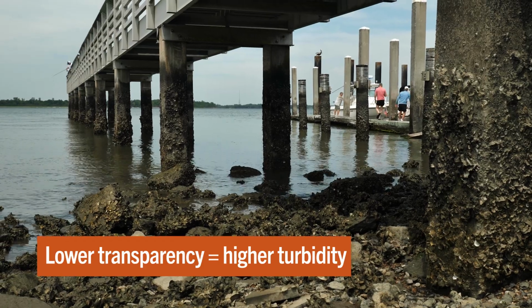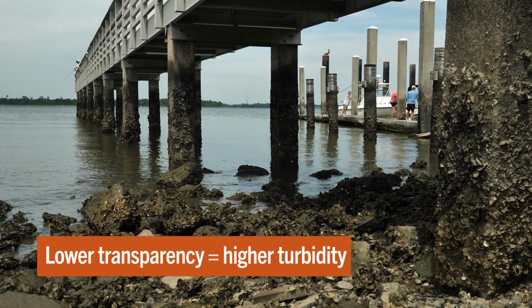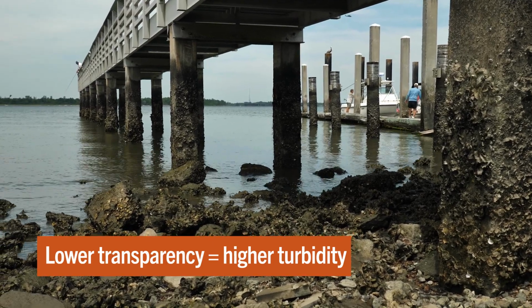The Adopt-a-Stream database calculates a site's turbidity during a sampling event from the transparency measurement reported at a site. We'll talk more about the factors affecting transparency and turbidity in the transparency tube demonstration video. Watch these next two videos to learn how to measure transparency at tidal saltwater sites.